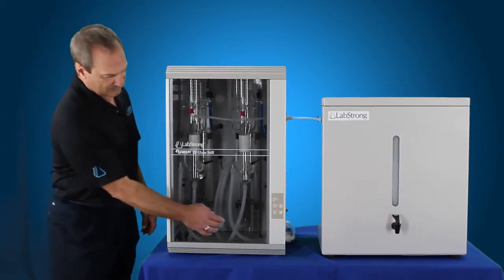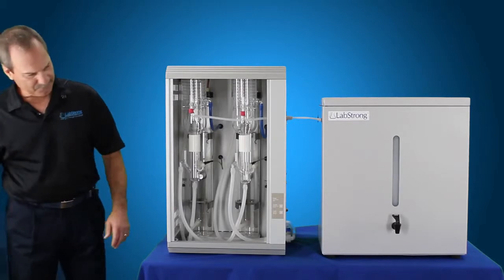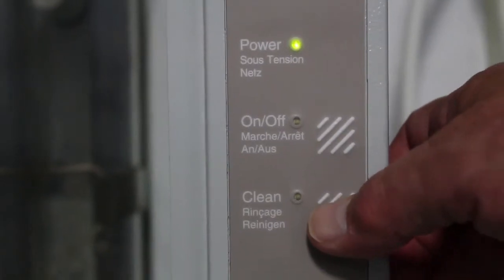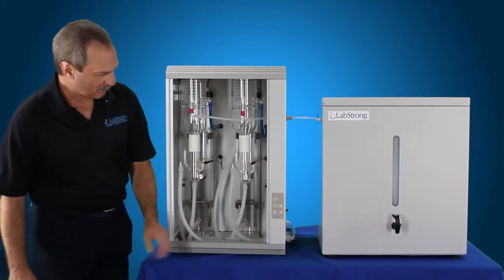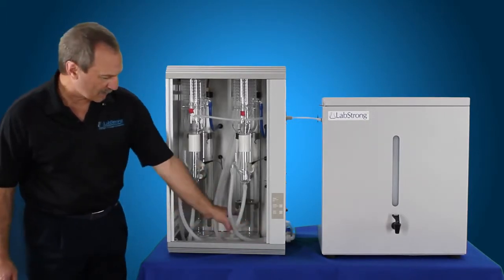What you want to do first of all is remove the door. Once you've set that aside, you'll see on the front there's a clean button and an on button. The clean button is what you want to press, and your incoming water is going to be on. So you press the clean button. What that does is it takes the drain valve assembly here and shuts it off so that no water comes out of the boilers.